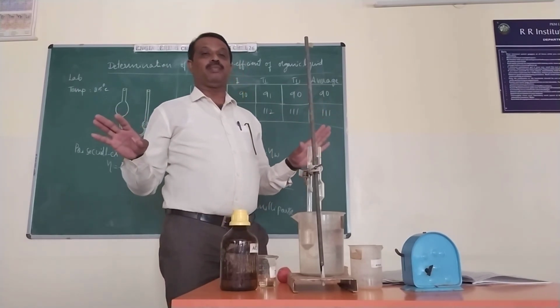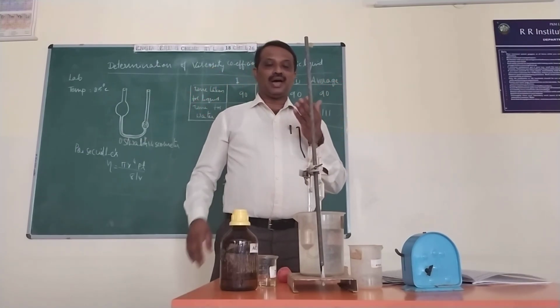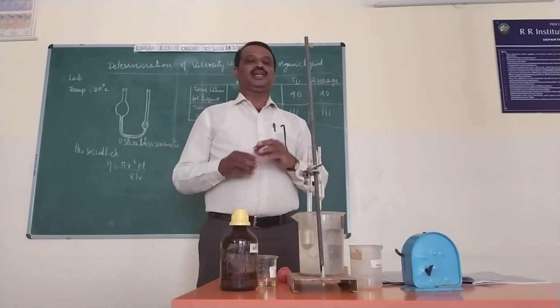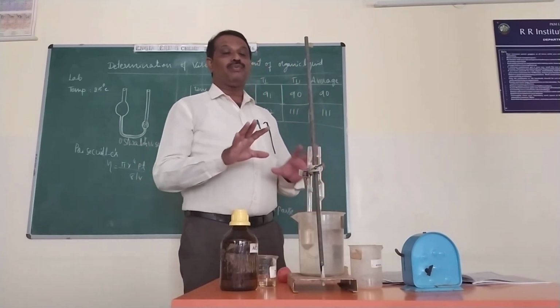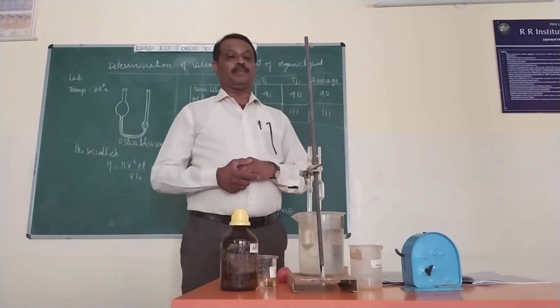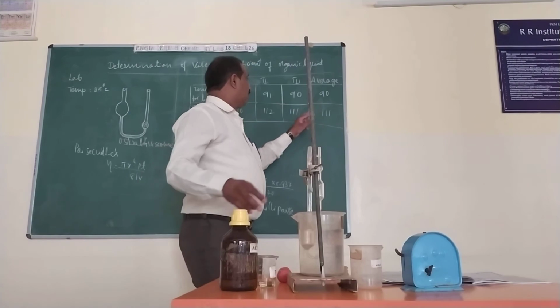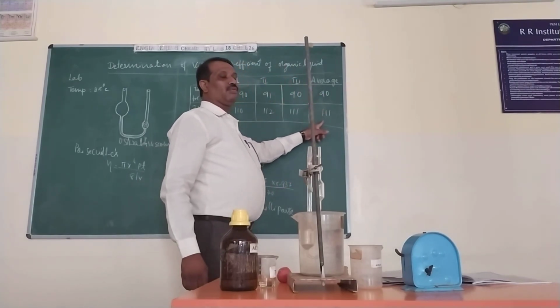In any other experiment, we have not taken average values, because it is the effect of temperature. The liquid movement is an effect of temperature. The temperature and pressure do not vary the constant values of the analyzer, so we won't take an average. Because of this inversely or directly proportional movement, there are variations of values because of temperature and pressure. At that time only we have taken the average.